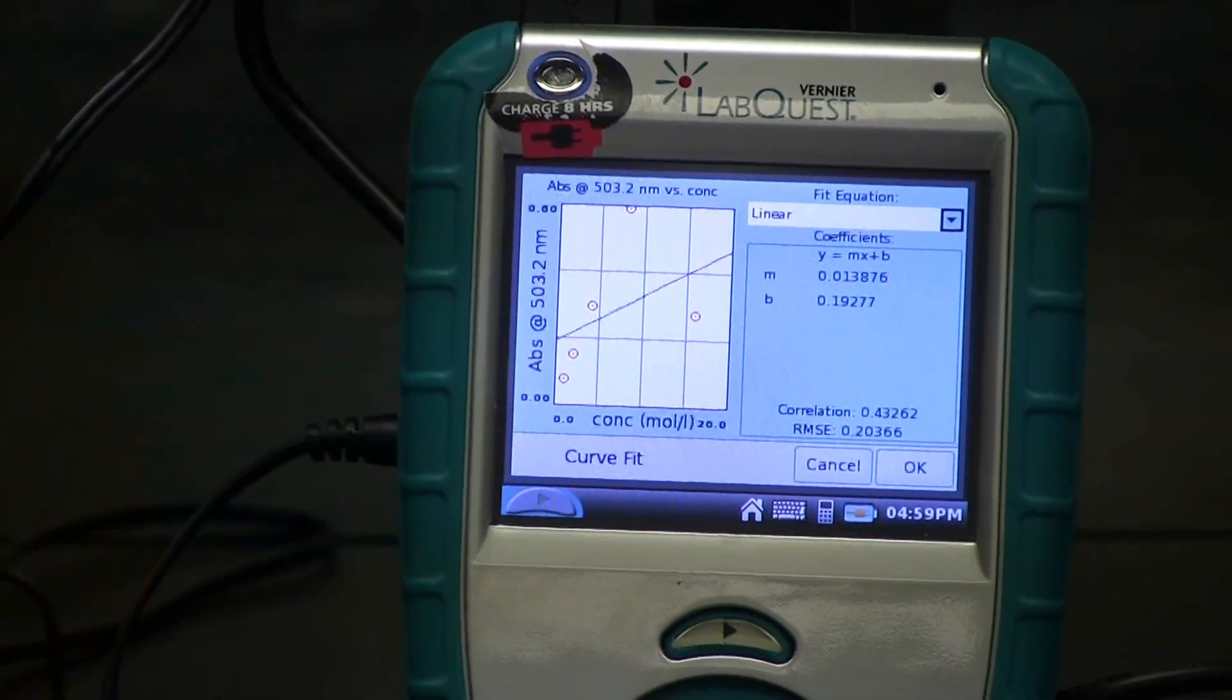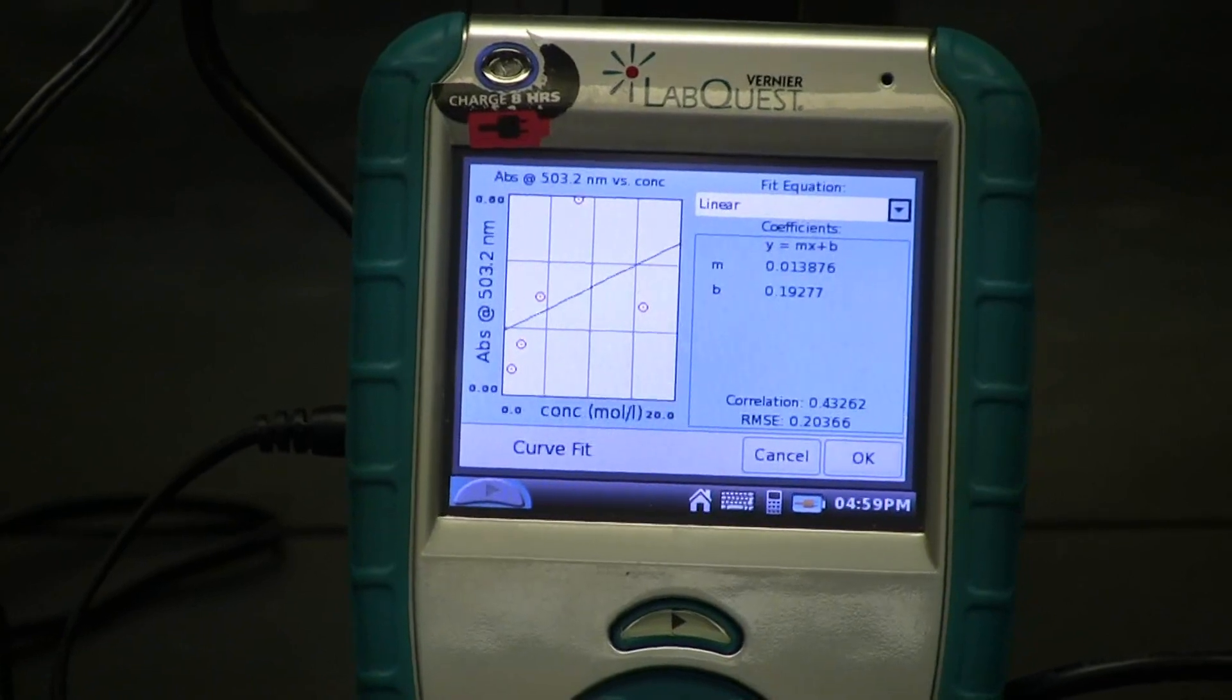You now have your curve fit equation. Click OK.